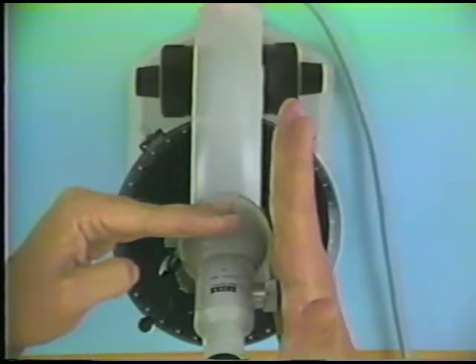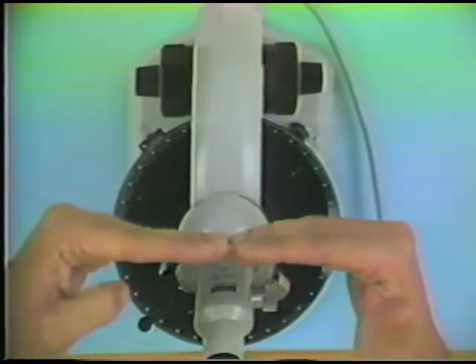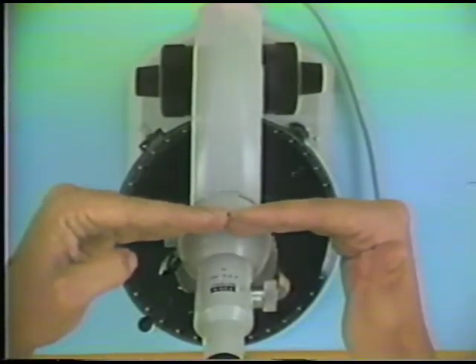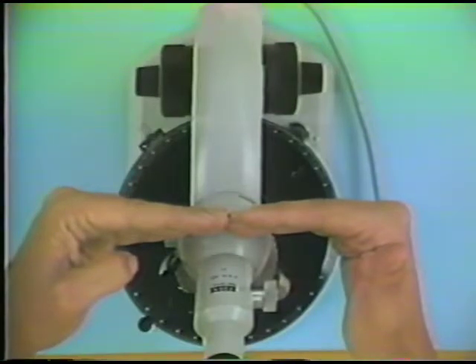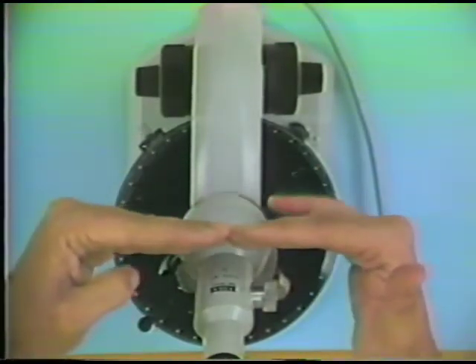Now the polarizer that's below the stage in a Zeiss microscope is always east-west. That means that the permissible vibration direction of light as it comes up toward the stage of the microscope is only in this east-west direction.